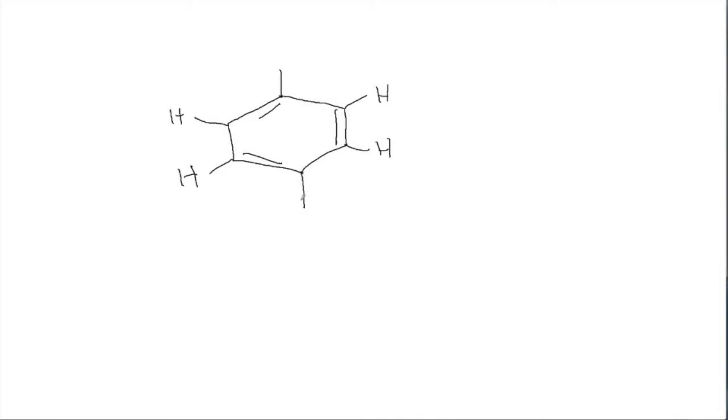You need to have this type of symmetry. So that's good. You know there's an aldehyde group because of the 9 to 10 absorption. And then now the rest of it pretty much falls into our laps. We know there's a methyl group and an oxygen. So that has to be this. One thing you guys should probably be doing is we've got here CH3O2.